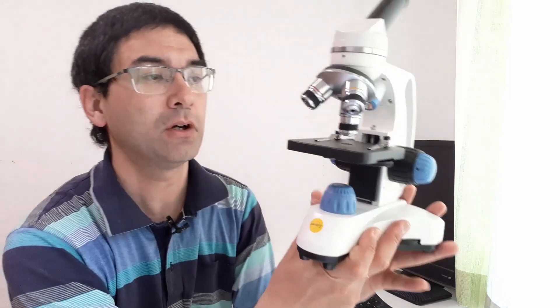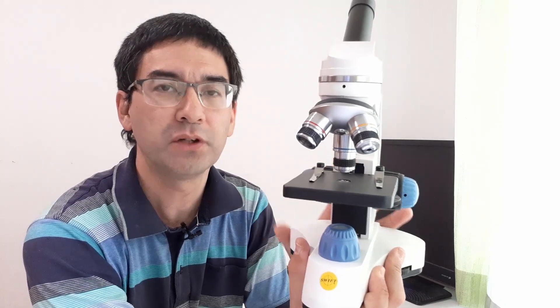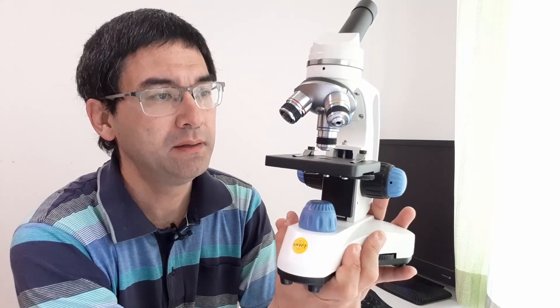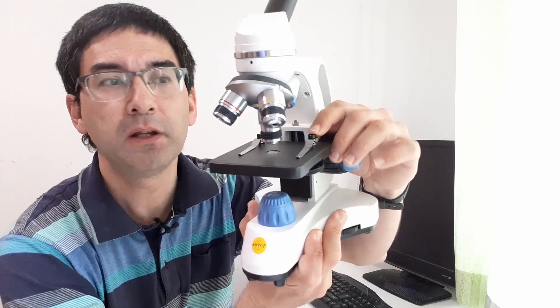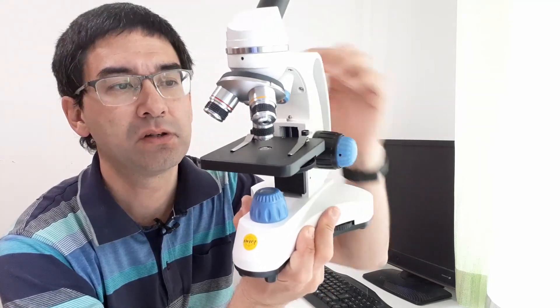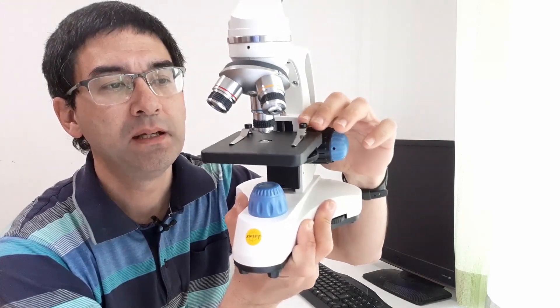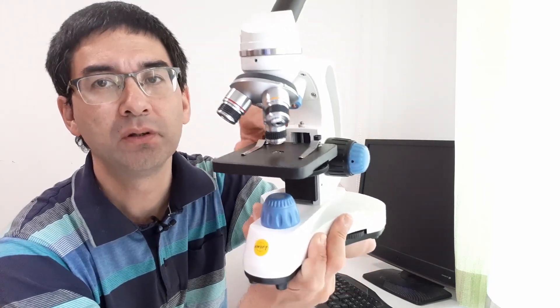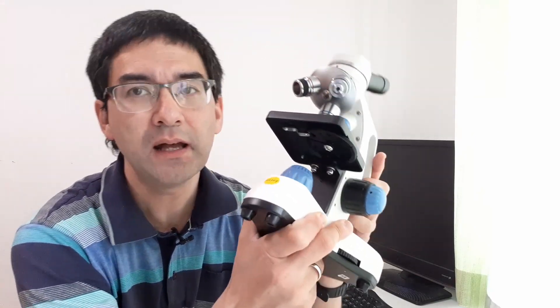I want to talk about a few things where they actually did some cost savings because a microscope that costs only around 100 euros or dollars, you've got to cut down the cost somewhere. One of the ways where you can cut down the cost is of course not by including a mechanical stage but by including stage clips. So the slides are held in place by those clips. That's one way of saving money because otherwise you have to have an additional quite complex mechanical system here to move the slide.